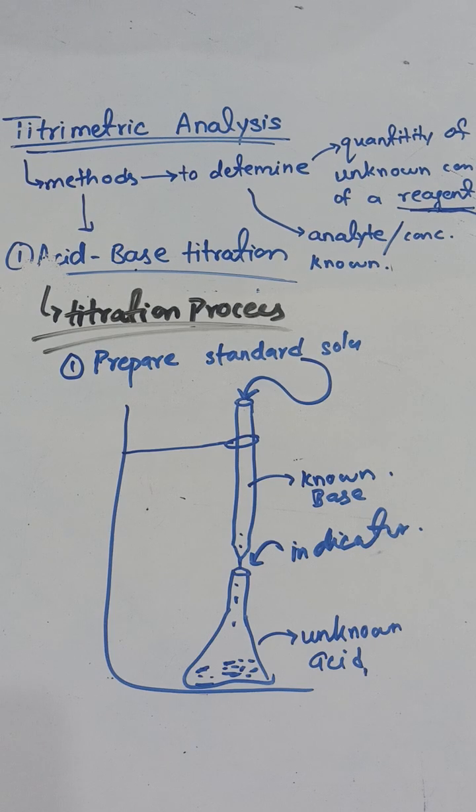After discussing almost everything about the titration, the last thing that we will discuss about this acid base titration is their theories.